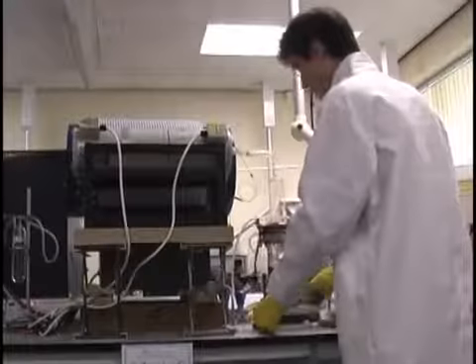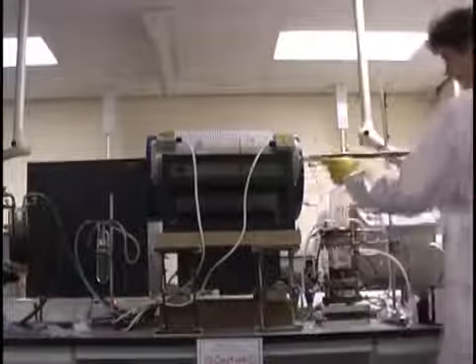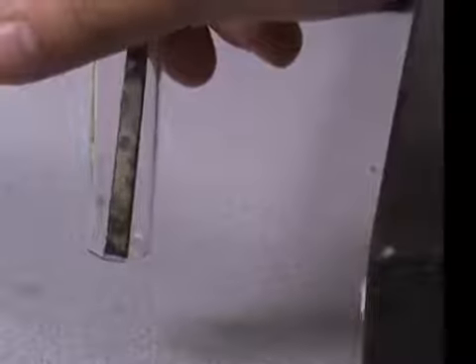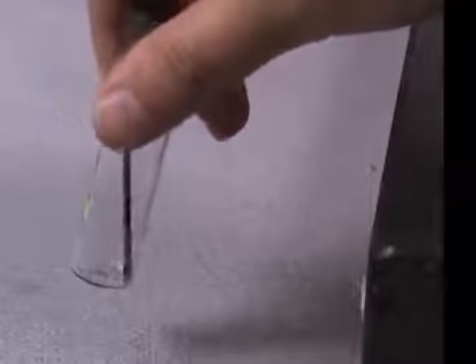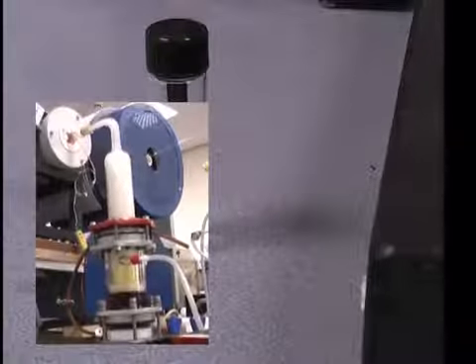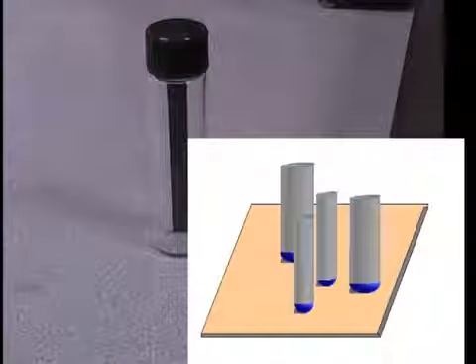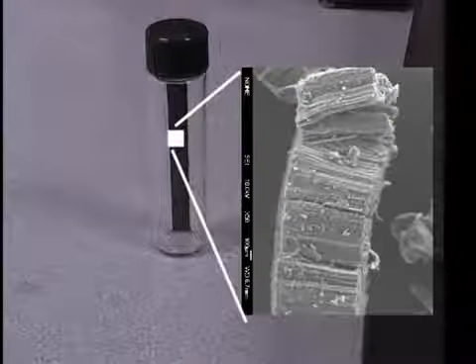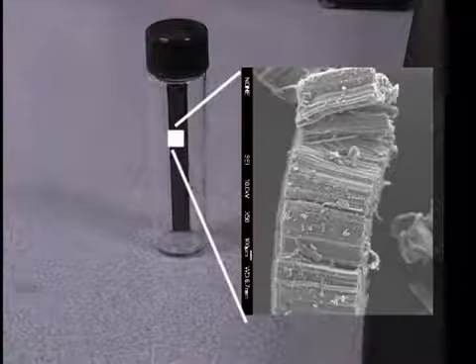Once the experiment is finished, he collects nanotubes from the soot stuck on the tube sides, and also the base, previously clean, which now has nanotubes all over it. CVD is probably the most promising method to produce carbon nanotubes for industrial use. It is easy to introduce other elements such as boron or nitrogen in the starting chemical. The diameter of the tubes can be chosen by the size of the metal catalyst particles. Also, we can grow the tubes on the surface, which helps for future applications.